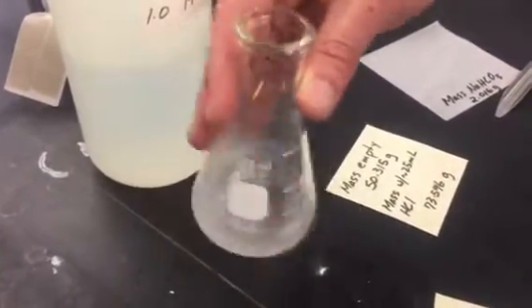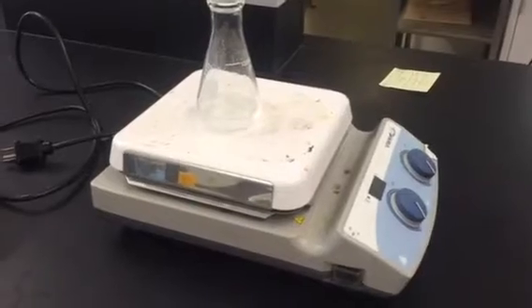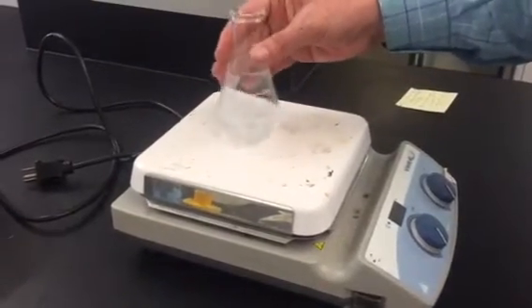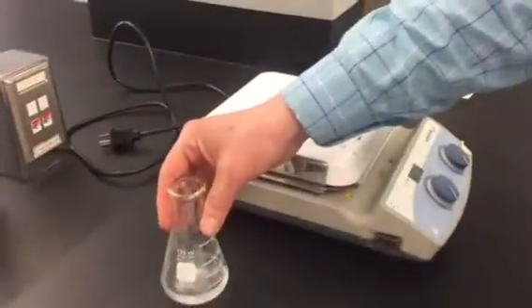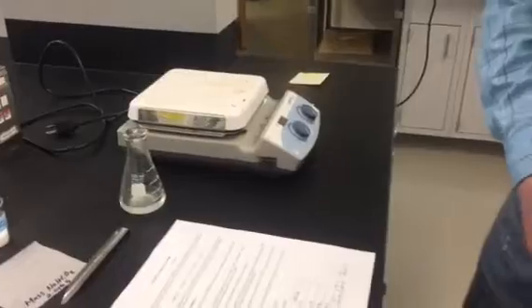And because we know that carbon dioxide can stay dissolved in water, we're going to heat gently the whole reaction mixture on the hot plate for a few minutes until we stop seeing the bubbles that are characteristic of that carbon dioxide. And at that point, we're going to take the flask off the hot plate, let it cool for a few minutes to come back to room temperature, and then we're going to take the mass again.